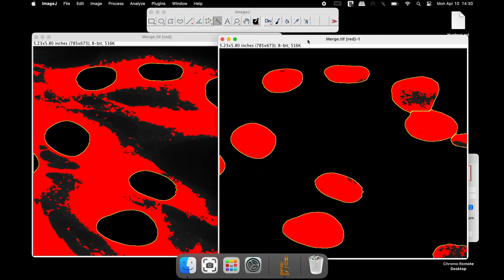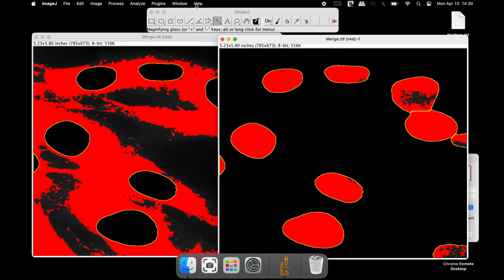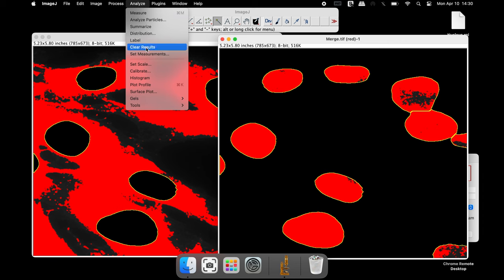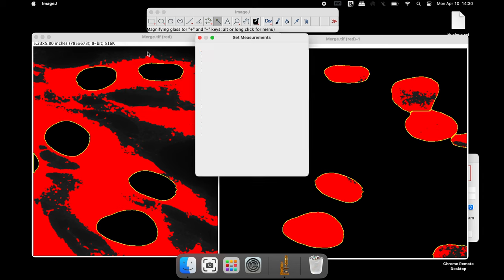To perform the intensity analysis, click on Analyze and Set Measurements. In this window, select all the parameters required such as Area, Integrated Density and Mean Gray Value. Select the option Limit to Threshold and then click OK.